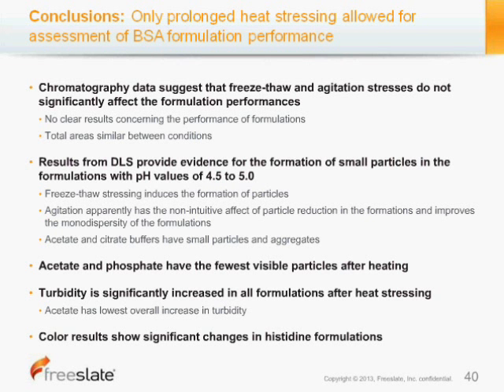We also showed that the turbidity increases significantly across all formulations, and here acetate had one of the lowest overall increases in turbidity. As I mentioned before, the color results were significant, especially in the histidine formulations and a few other formulations. And really, together, what this data is suggesting is that a lot of the stability of these formulations may have actually been due to the non-protein parts of the formulation.